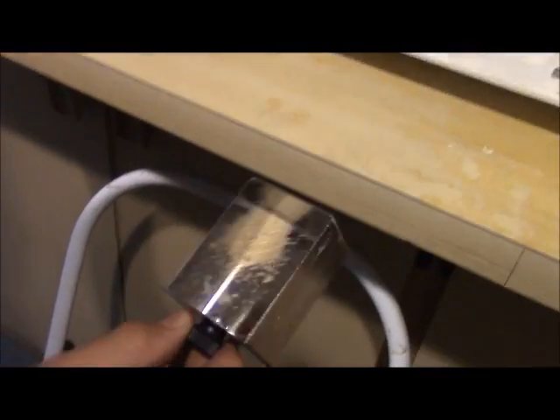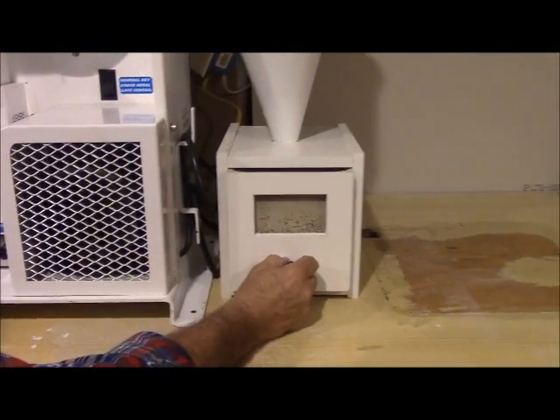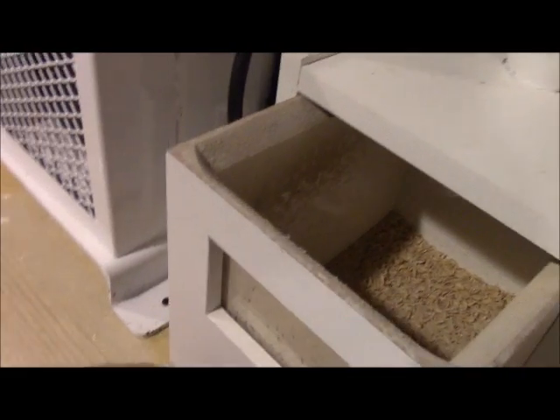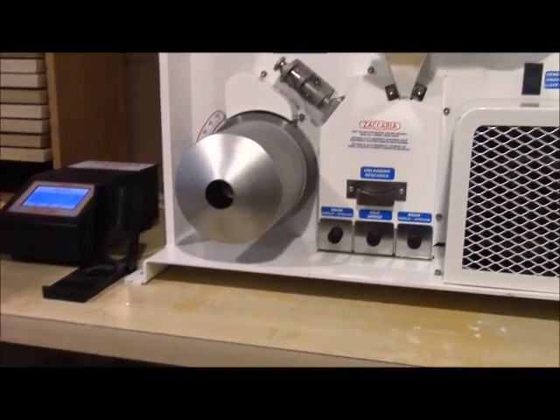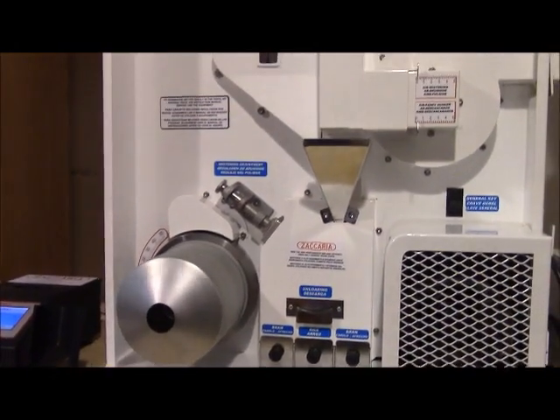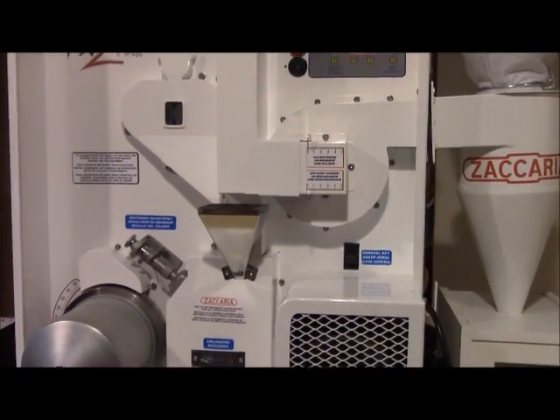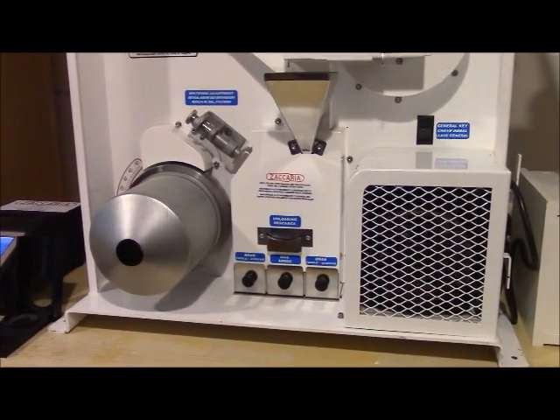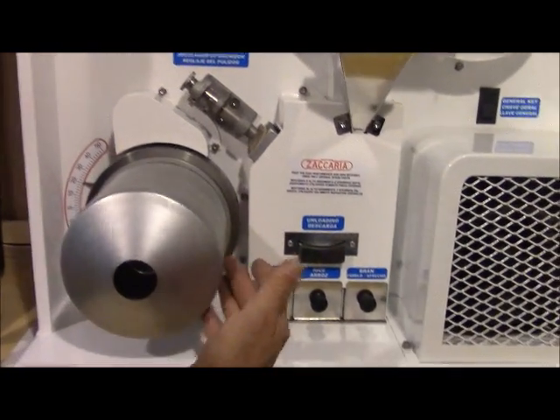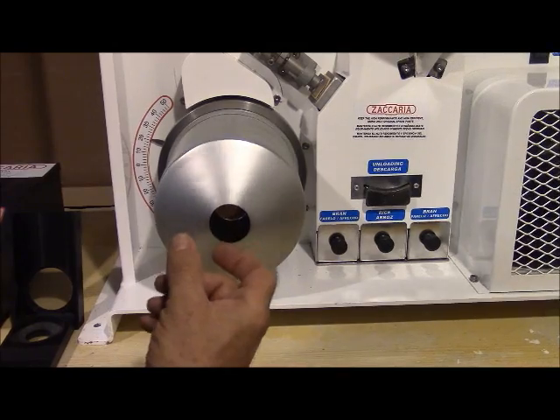This is the view of the bran that's taken out through the perforated screens of the whitener. This chamber is where the husk and bran are collected. As the chamber rotates, the small kernels that fit into the pocket are lifted. There's a collection chamber in the interior that will hold the broken kernels that we take away from the head rice.